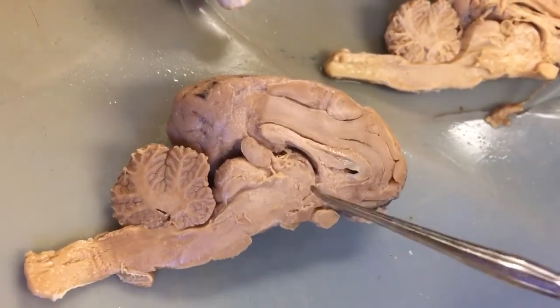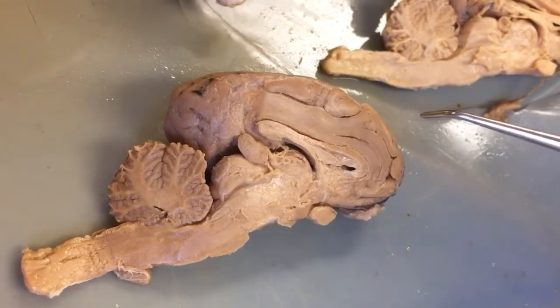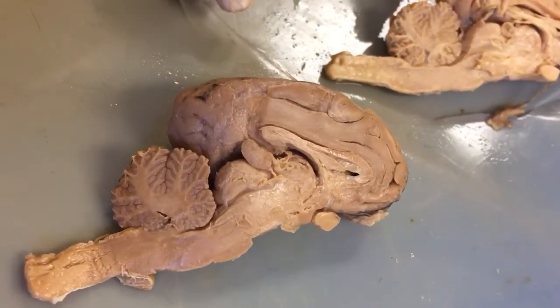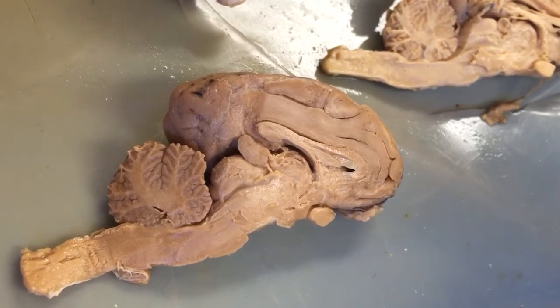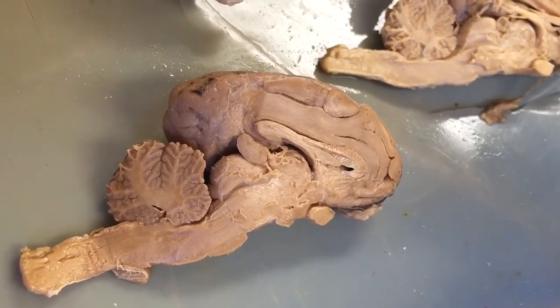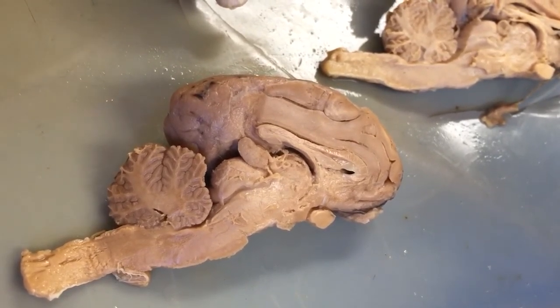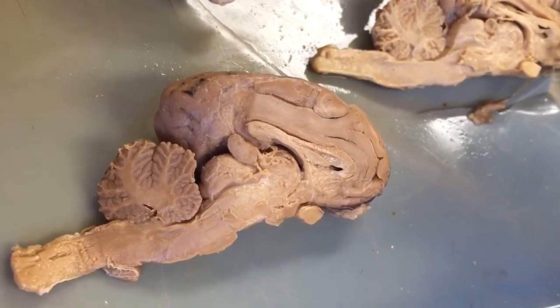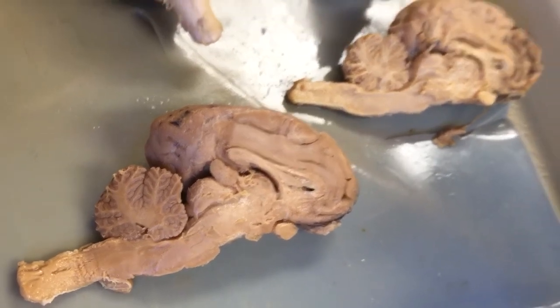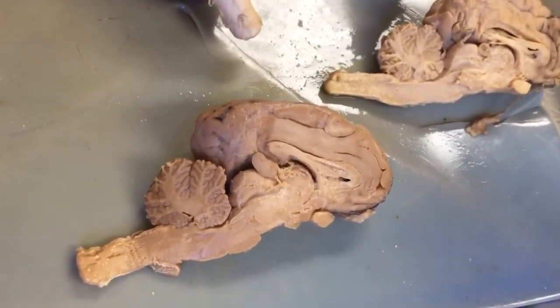So don't get too bogged down in the really challenging parts of the brain. Mammillary body, we did all that. We covered everything.